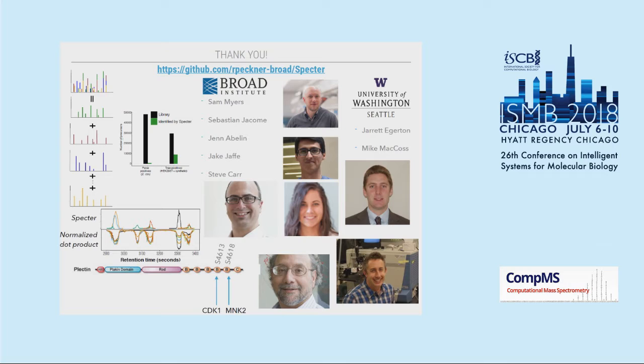Oh, yes. So for each window, for each MS2 spectrum, we subset the library to only consider precursors whose mass to charge actually fall into the window. But within that, we've used libraries ranging from tens of precursors to tens of thousands, hundreds of thousands. Connecting to the previous question, the size of the library is surprisingly less of an issue than you would think. As soon as something's there, it tends to be well identified and well quantified with this method, unless there are a lot of other members of the library that look very similar to it, and then you take those out. That can conflate the analysis further.